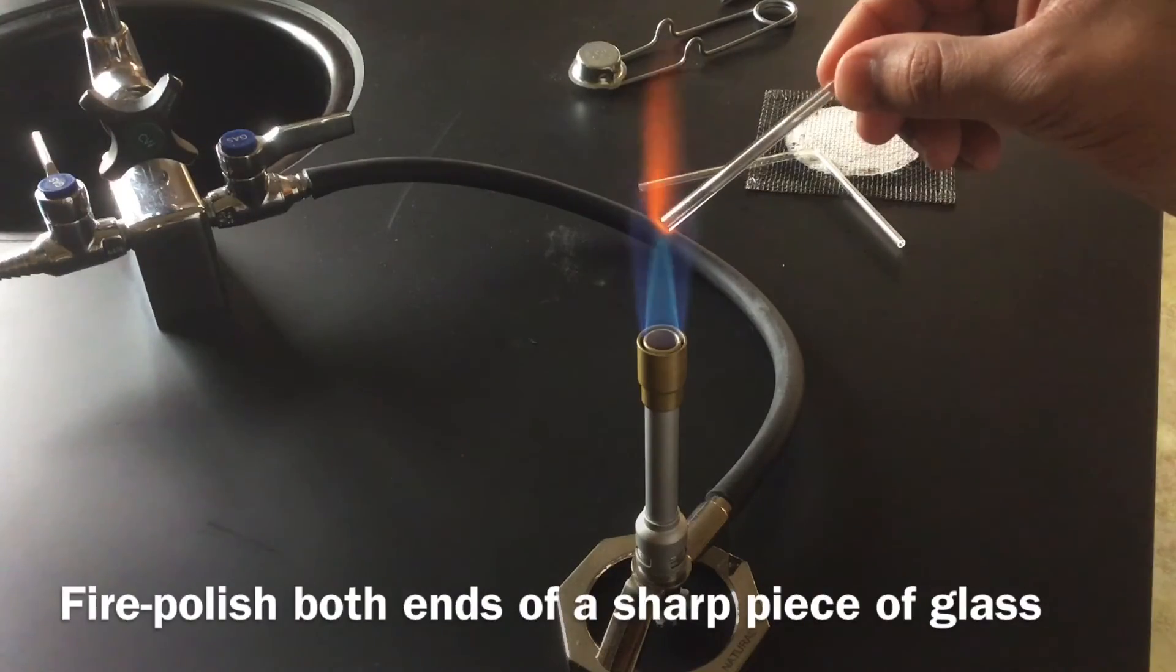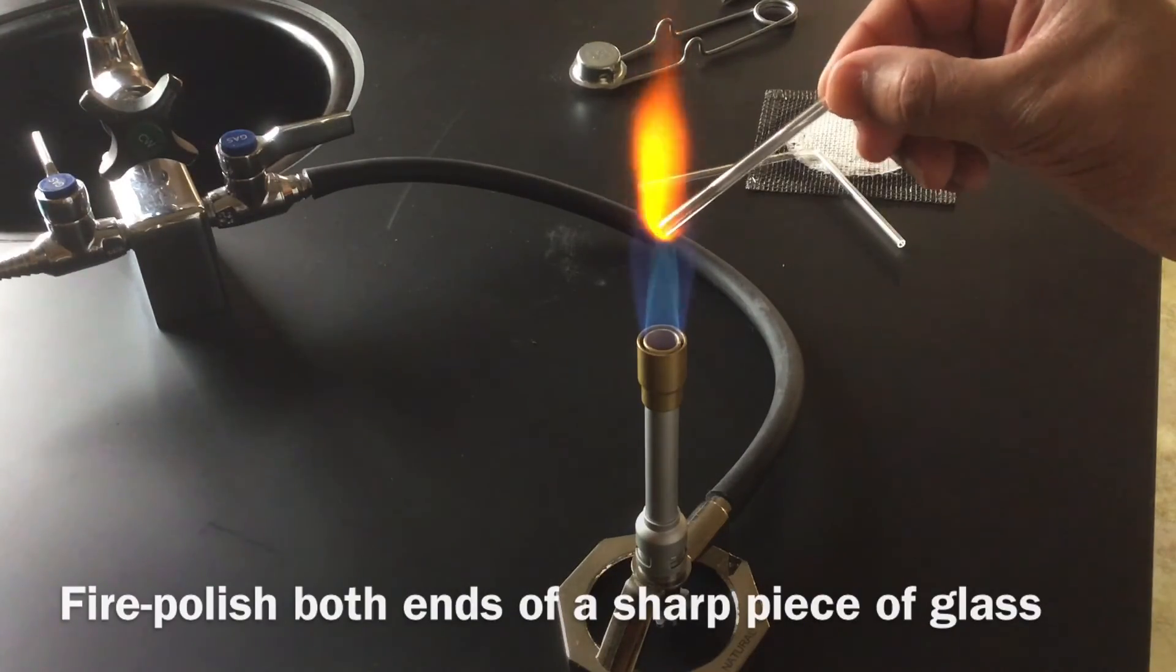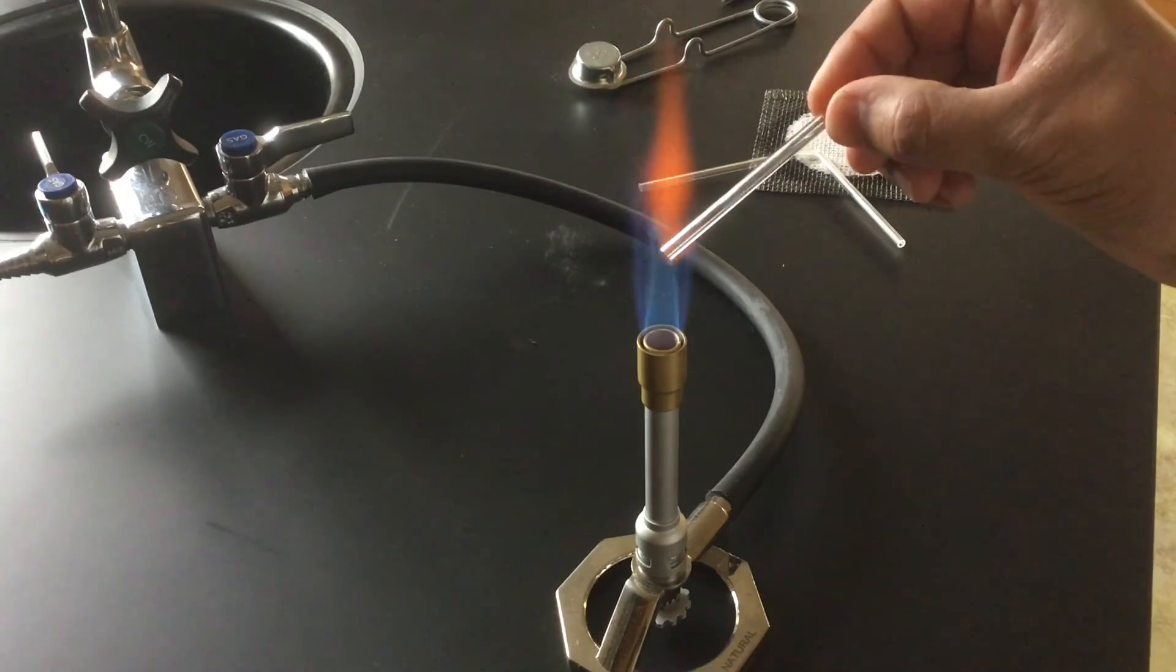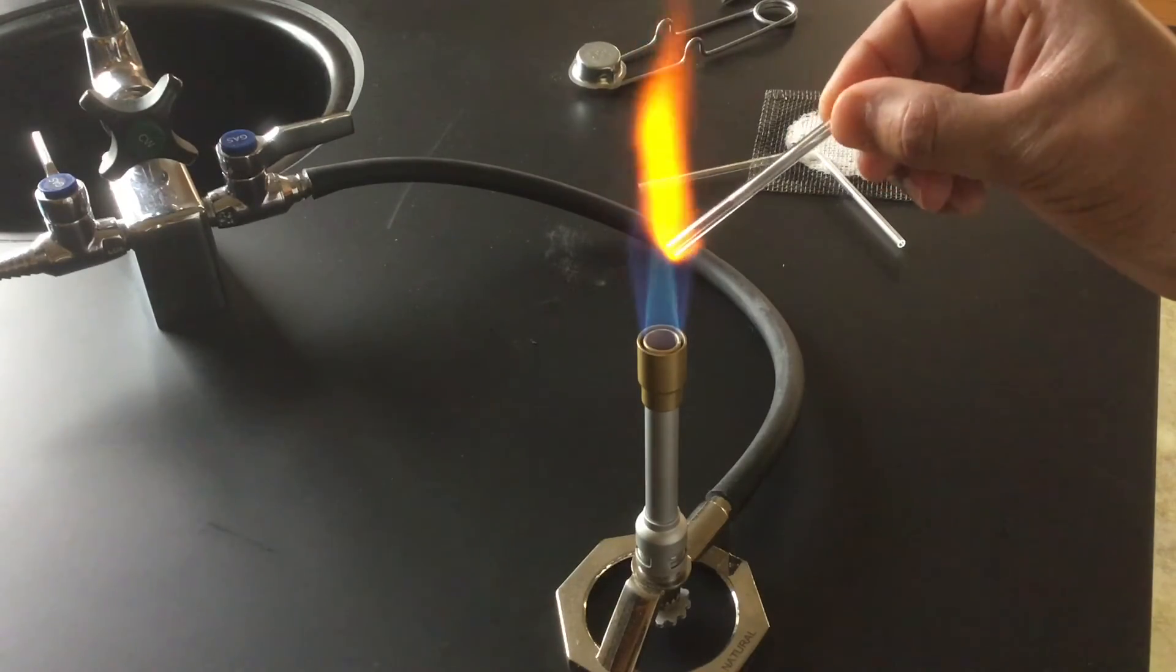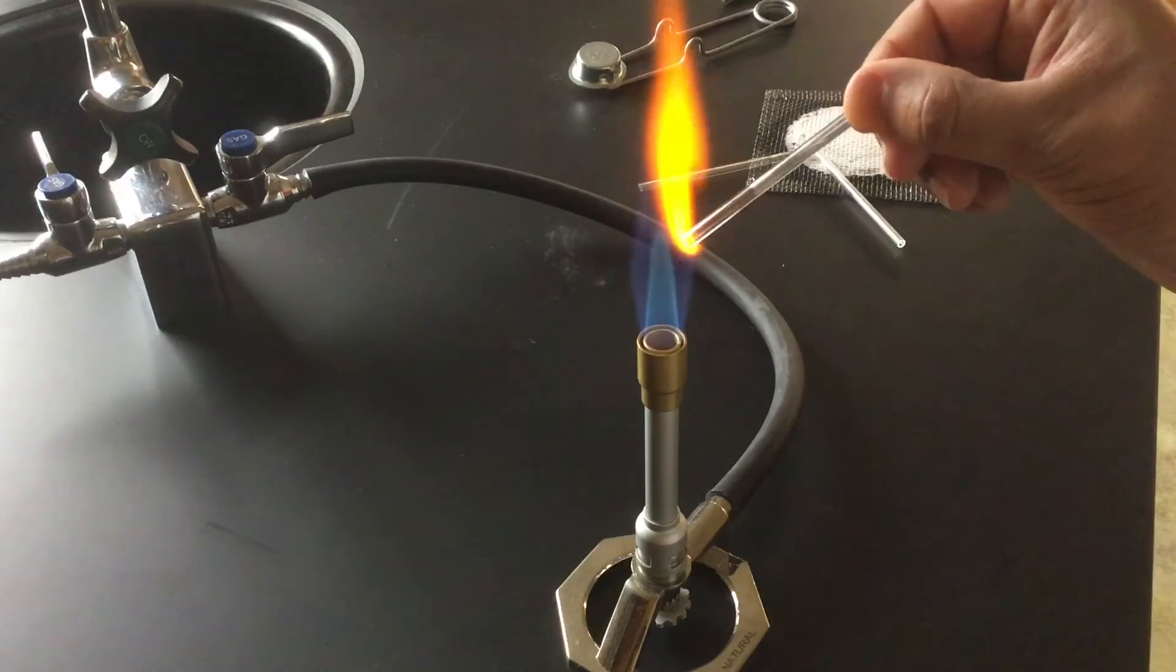Fire polish this opposite end holding it at about a 45 degree angle, just twirling it around between my thumb and forefinger in the flame. It doesn't take very long for this to happen.